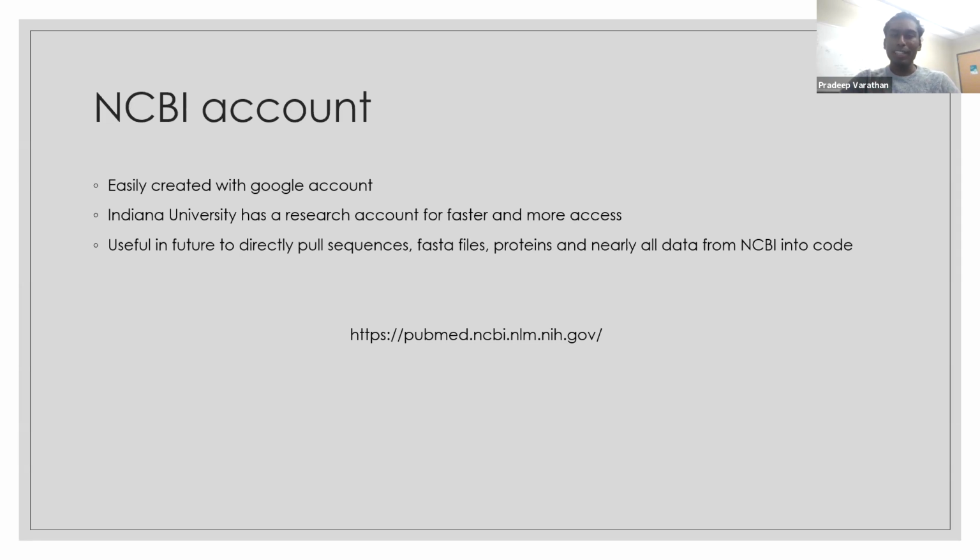It's really important because if you're working with one or two sequences, that's fine. But if you're working with, let's say, 100 to 200 sequences at a time, you don't want to go to your web browser, open the NCBI account, and download the FASTA sequence every single time. Rather than that, you can do it within two or three lines of code in BioPython, and that's where creating an NCBI account comes into play.